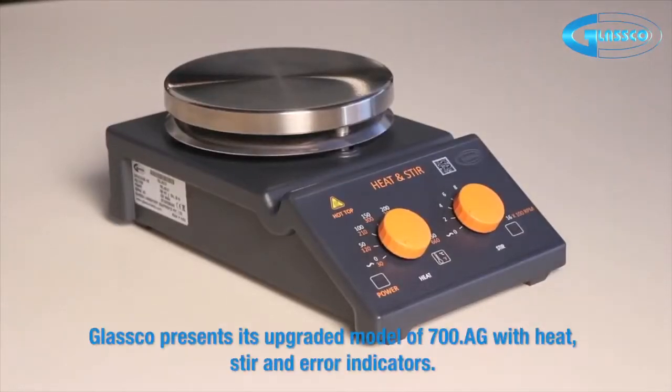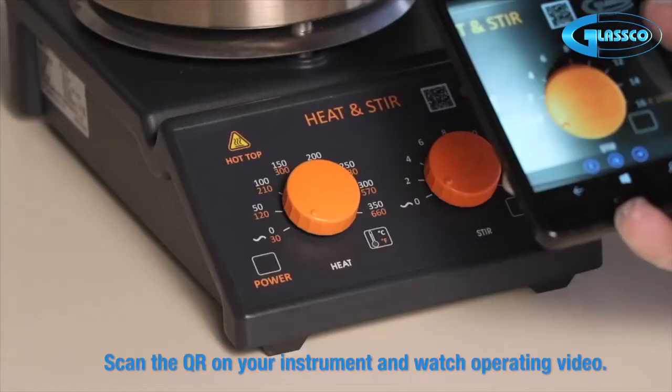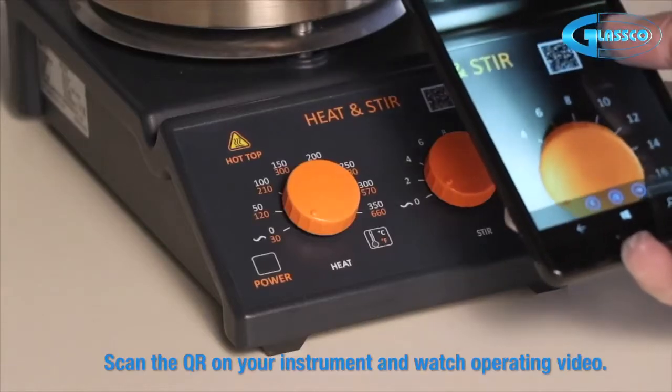Glassco presents its upgraded model of 700 AG with heat, stir, and error indicators. Scan the QR on your instrument and watch the operating video.